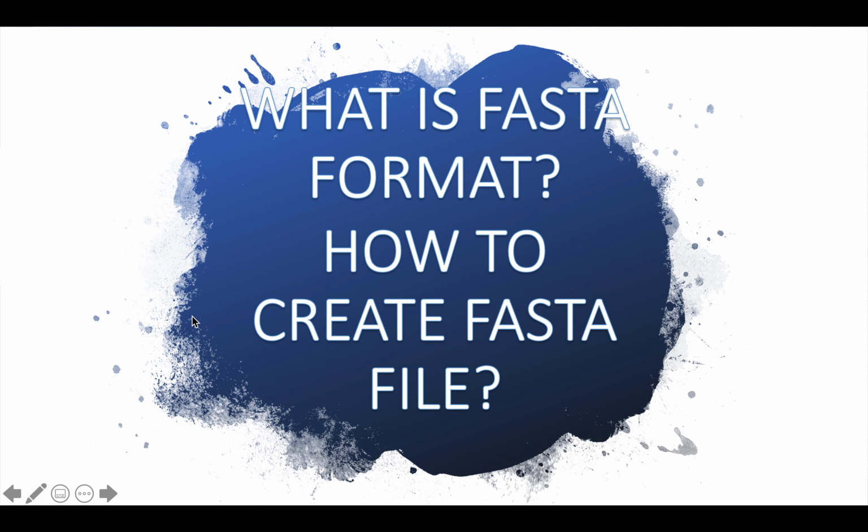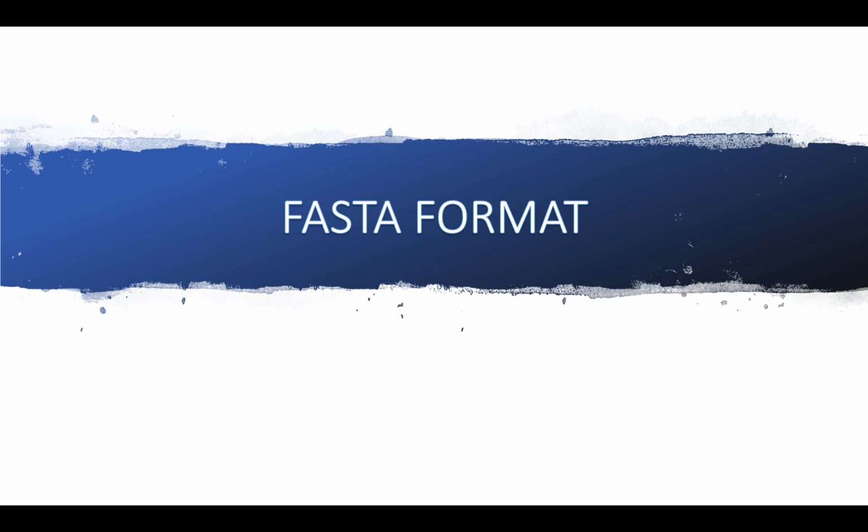Hey guys, so for today's video, let's talk about the FASTA format and how to create a FASTA file. So what is a FASTA format?